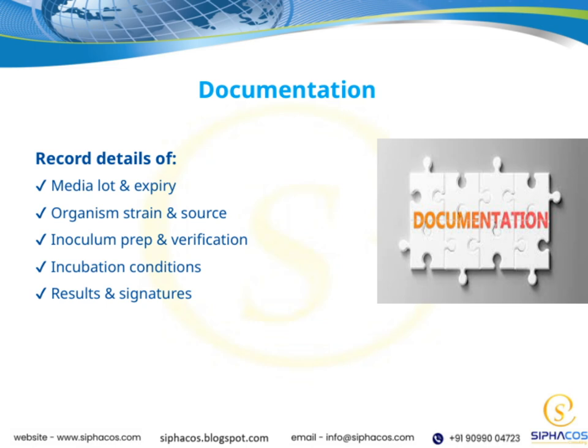Don't forget to log the incubation conditions, since factors like temperature and time are vital for reproducibility. Finally, all results should be clearly documented, along with signatures from the responsible personnel to authenticate the records. Proper documentation ties everything together, ensuring our process is transparent, compliant, and ready for review.